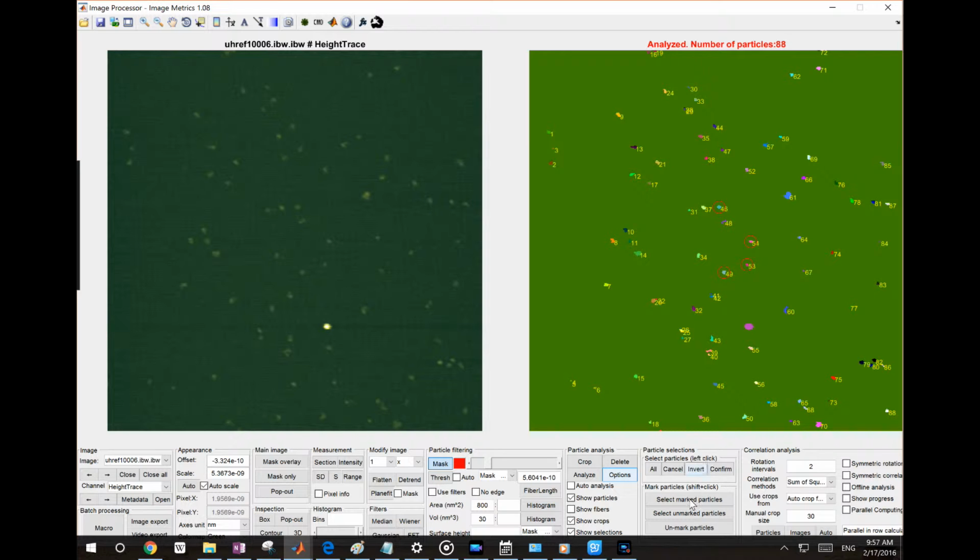With marked particles, you have several options. For example, you can unmark this particle, and then mark this particle. You can also mark only this particle, then only one particle is marked. The marked particles give you some kind of preview before you make your final selection and confirm it. Once you have marked them, you can choose select marked particles, select unmarked particles, or simply cancel the mark. For example, if I select unmarked particles, now these four particles are not selected.